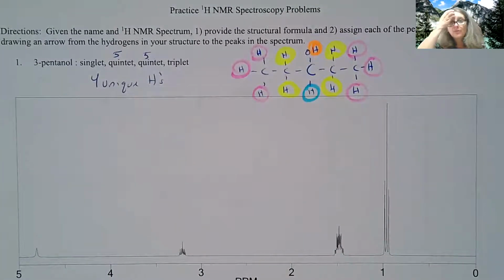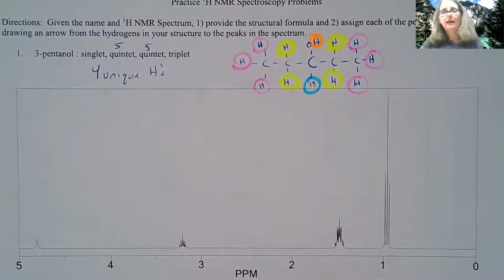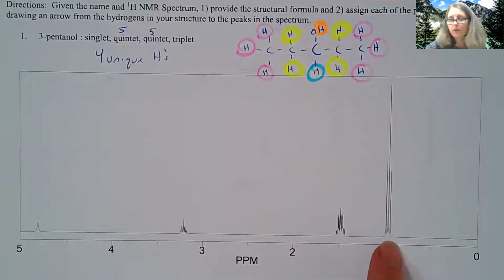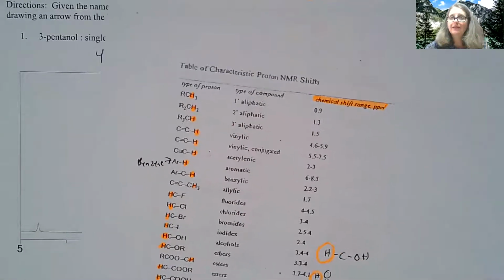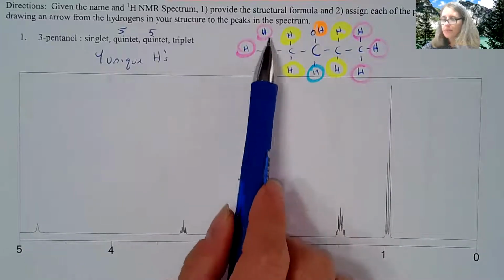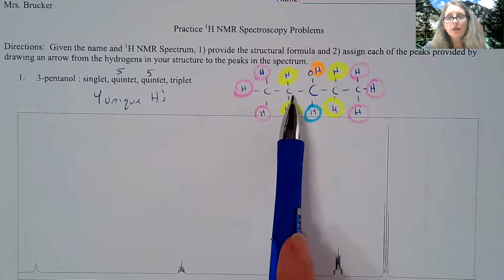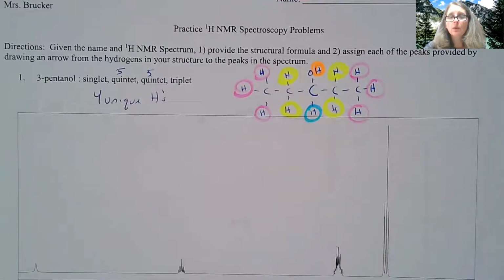And then the last hydrogen is probably going to be this hydrogen that is on the carbon that has OH. Now, a couple things to look for in an NMR, okay? First one I always look for is what I call a triplet around 1. That is usually a CH3 group, usually around that 0.91 area. And because the neighbor carbon here, I am the pink hydrogen. So please again, remember, you are the pink hydrogens. Your next door neighbor is this carbon here.